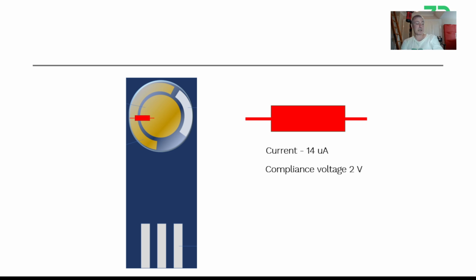So it starts to become a problem when you're using low power potentiostats, because these days they may only be getting a potential of, once upon a time it was 5 volts, these days it might be down to 3 volts. And again, it wasn't a problem when you had large potentiostats, but potentiostats have got smaller. So suddenly you're expecting this signal versus concentration, you start plateauing out in the signal and you think, well, this must be my assay, but it's actually your compliance voltage. The instrument is not able to apply enough compliance voltage.